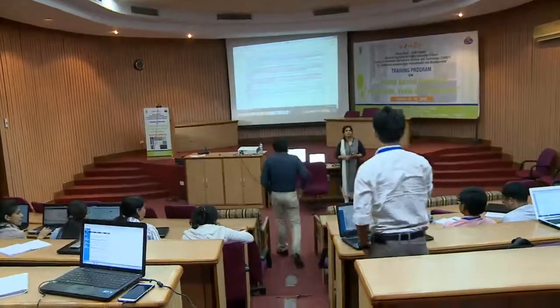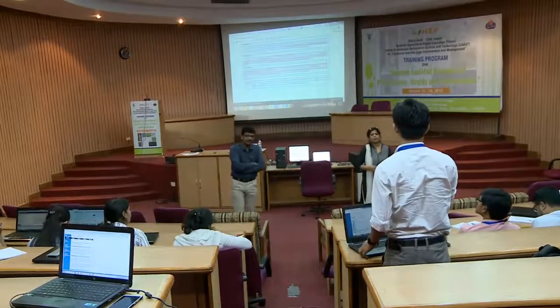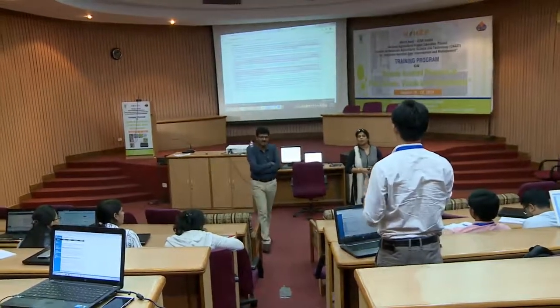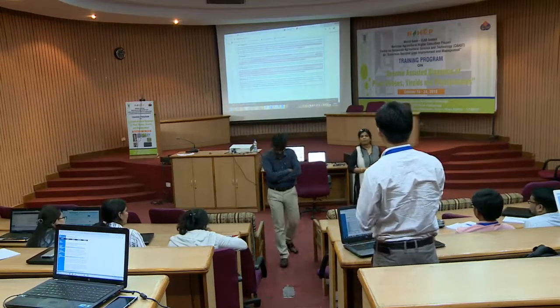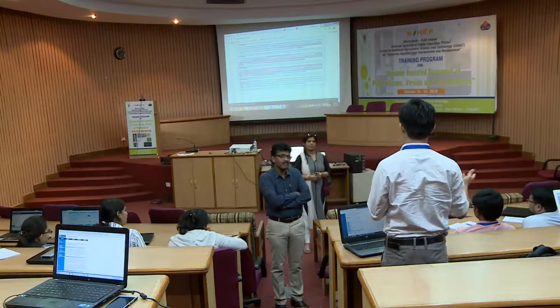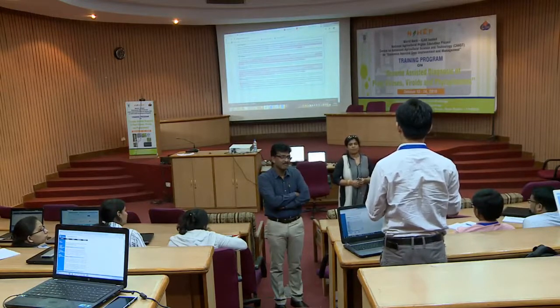Thank you, ma'am. Myself, Anam Washington. I'm doing my PhD, third year. My question is, we all know that NCBI has a very large database with so much data, and there are a lot of junk files out here, because it's very easy to put any file in this database. So how will we correctly find, when we are doing comparative analysis, taking sequences for a phylogenetic tree or anything like that for viruses, how much correct the sequence is, or how good the sequence is?